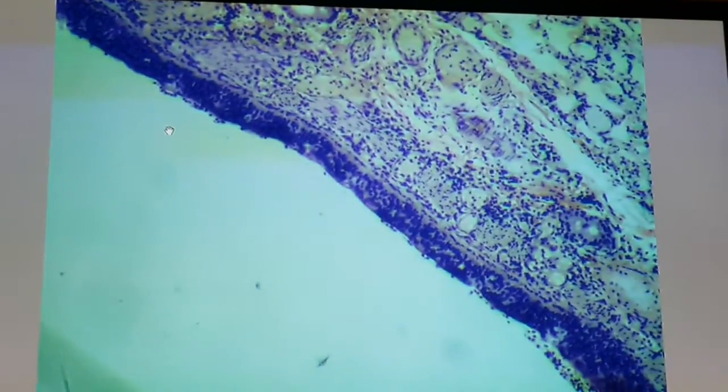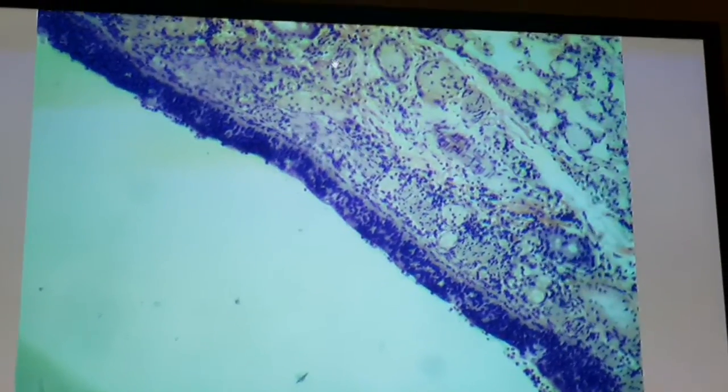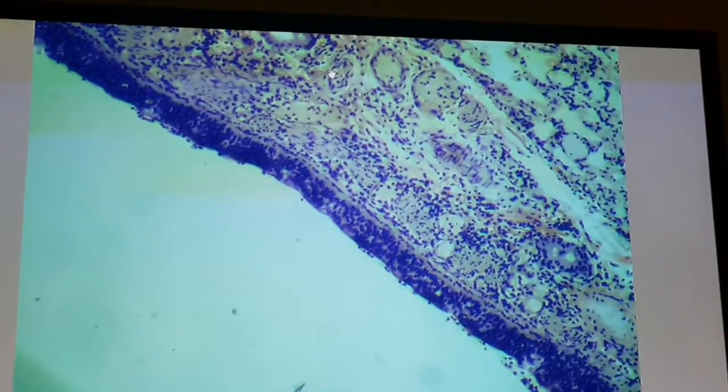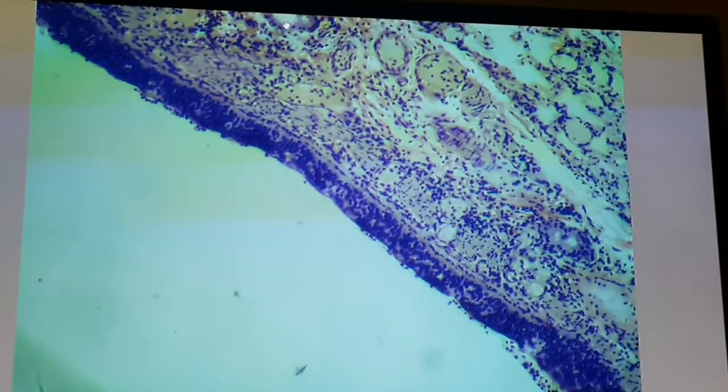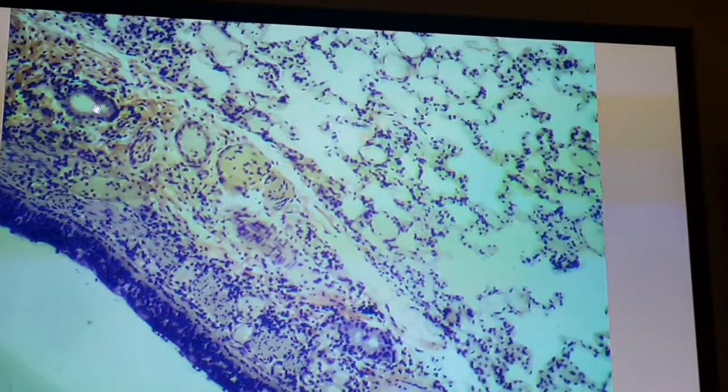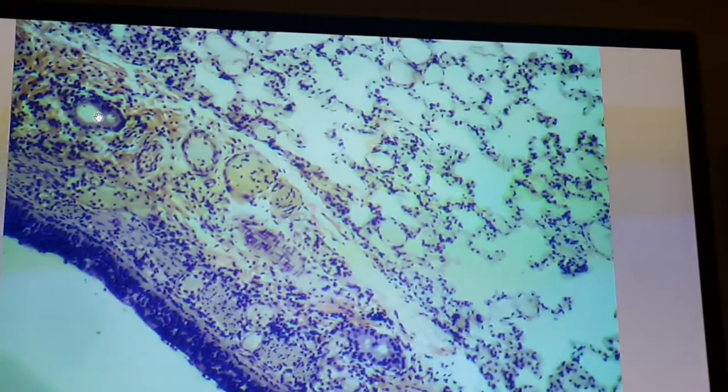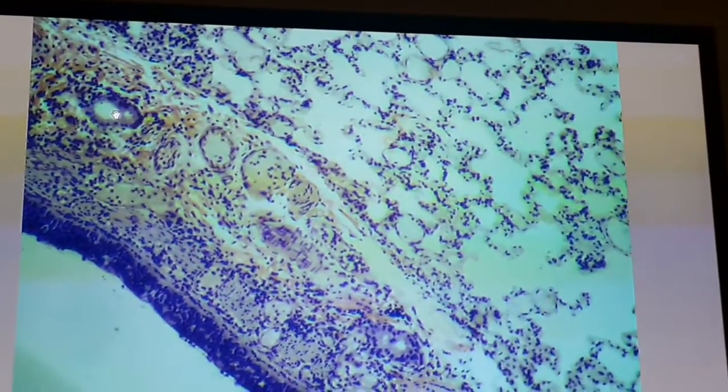The sub-mucosa is a loose type of connective tissue with glands in it. This is the sub-mucosa, showing the gland at the tip of the pointer, and it is also a vascular type of sub-mucosa. What is the type of gland in the sub-mucosa of the trachea and bronchite?